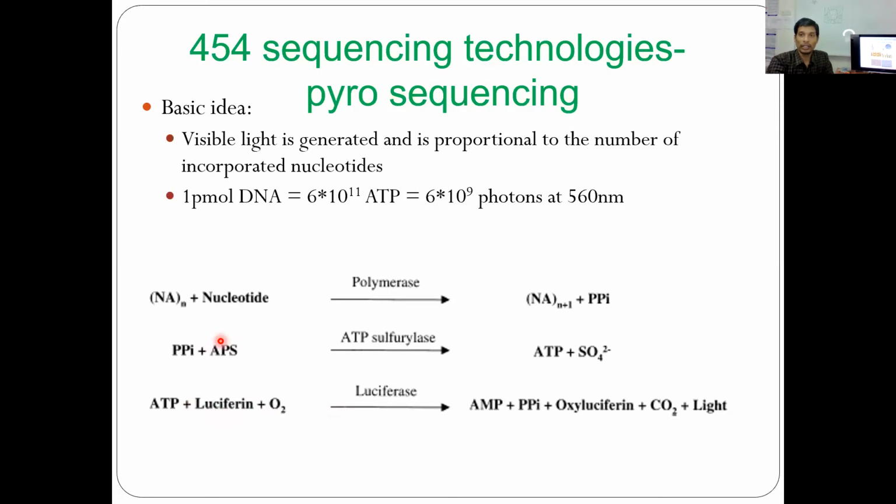The next thing that happens, the main reaction, happens once you introduce the beads to the plate. The picotiter plate will be placed into a different machine, where it will do the pyrosequencing reaction and sequence deciphering. So what will it do?